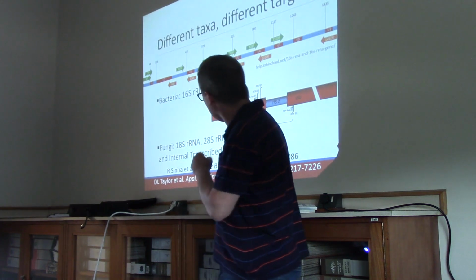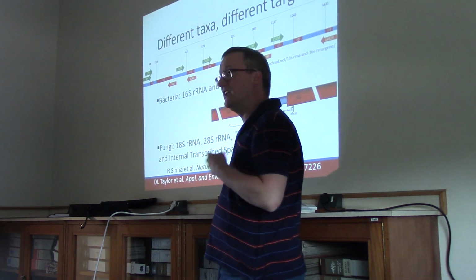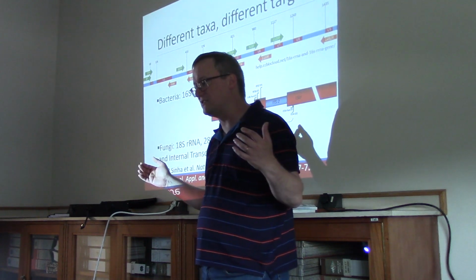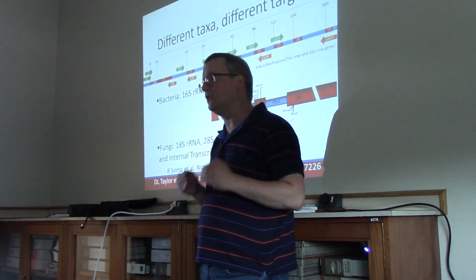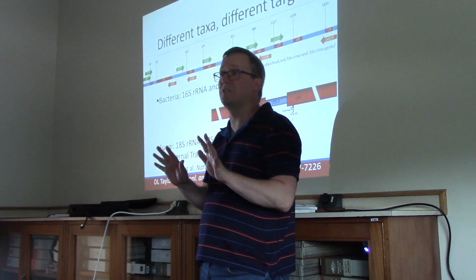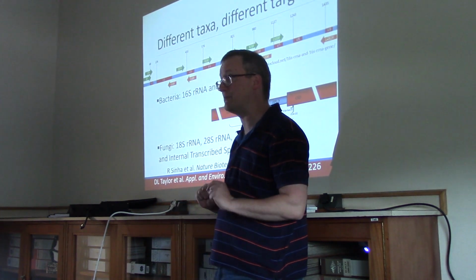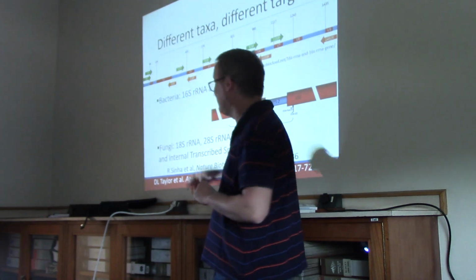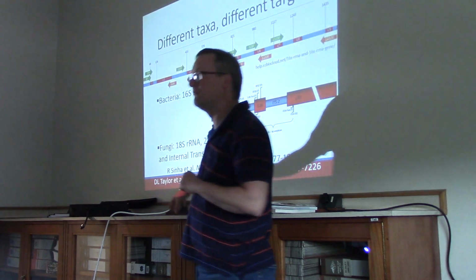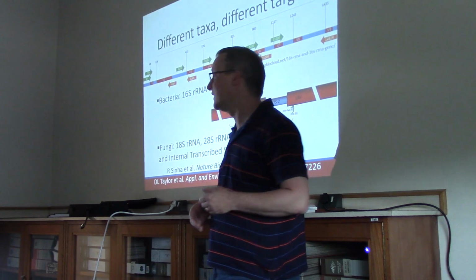All right, so this 16S ribosomal RNA is this genetic sequence that we are going to target in order to understand which bacteria are present. So I think that's a really important first point. If you're going after bacteria, 16S rRNA is a good option. If you're going after fungi, it's not your friend, right? Fungi have a very different ribosomal RNA sequence that can be used in this way.